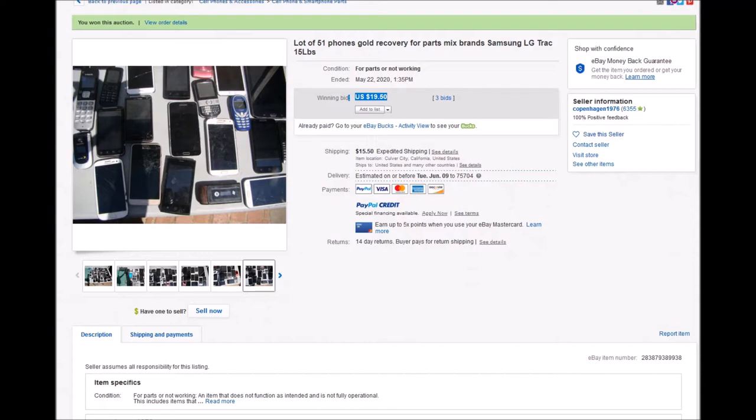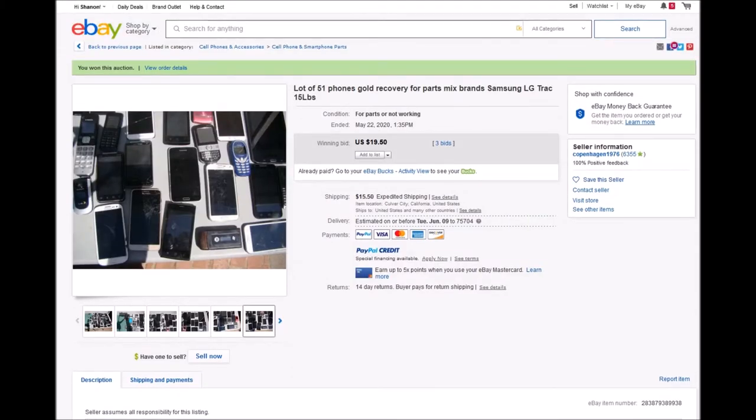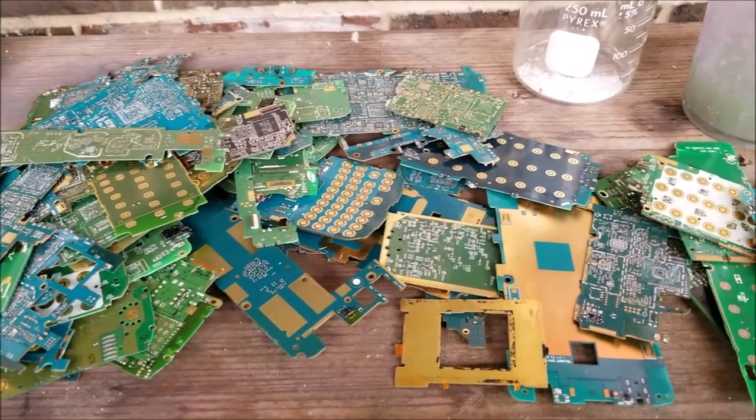You can see there are some old Nokias, an old Razor — a few of those actually. If you know anything about scrap cell phones, the Razors have quite a bit of gold in them, and I will show you. What I did is I depopulated the boards using a heat gun, and then I'm going to put them in nitric acid and distilled water to strip the gold foils from them. I also took out some of the connectors.